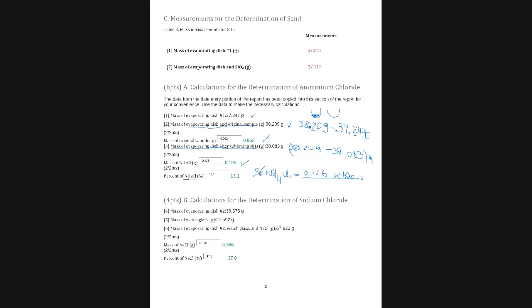The mass of the original sample, which is 0.962. When you do that, you get this 13.1.